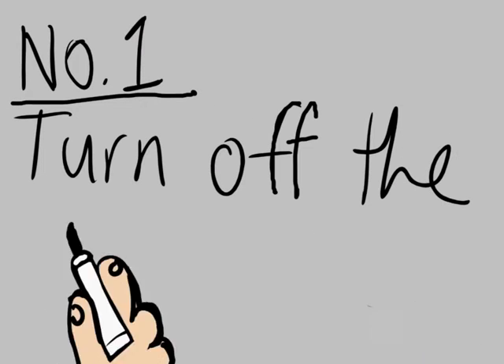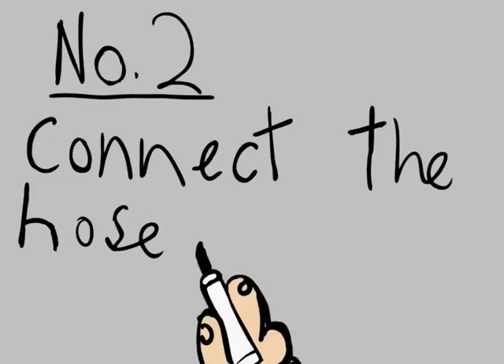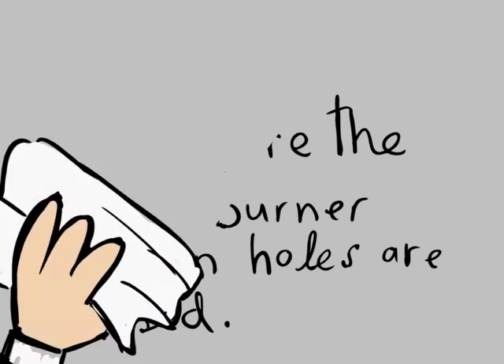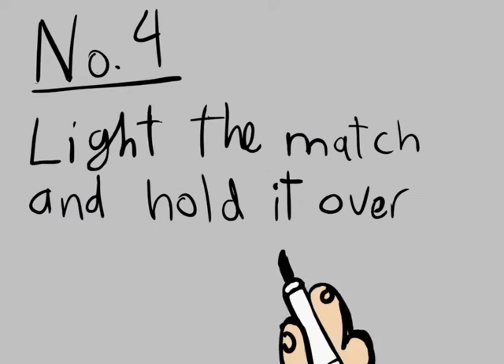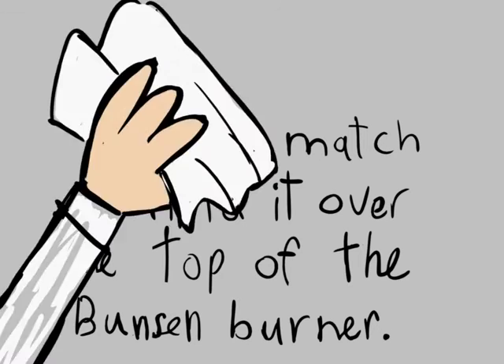Number 1: Ensure the gas tap is securely turned off. Number 2: Connect the hose to the gas tap. Number 3: Turn the Bunsen burner oxygen hole to close. Number 4: Light the match and hold the flame horizontally over the top of the Bunsen burner.